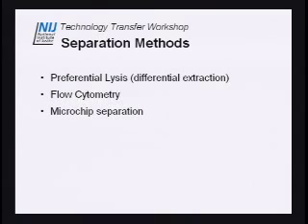There's also a lot of new research in microchip separation, and there are many funded NIJ research grants right now on that. I'm excited to see where that is going. Membrane filtration is another simple method to separate sperm from epithelial cells. Again, so far you need a lot of sample to do that.